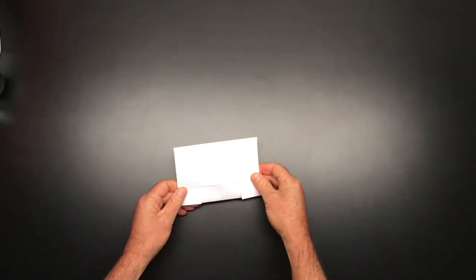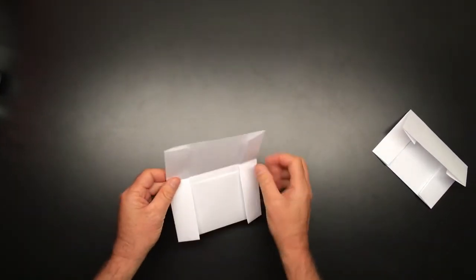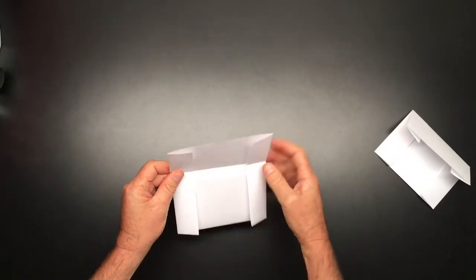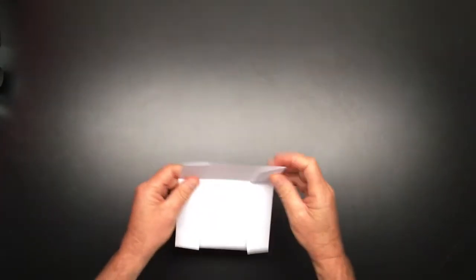An incorrectly folded packet will look like this with the gap here where the specimen can slip out. No good. This is the correct way.